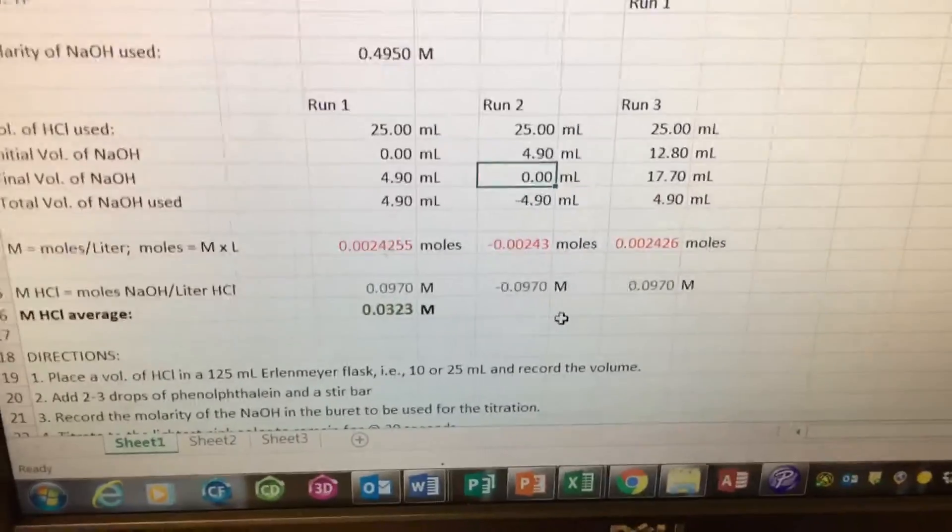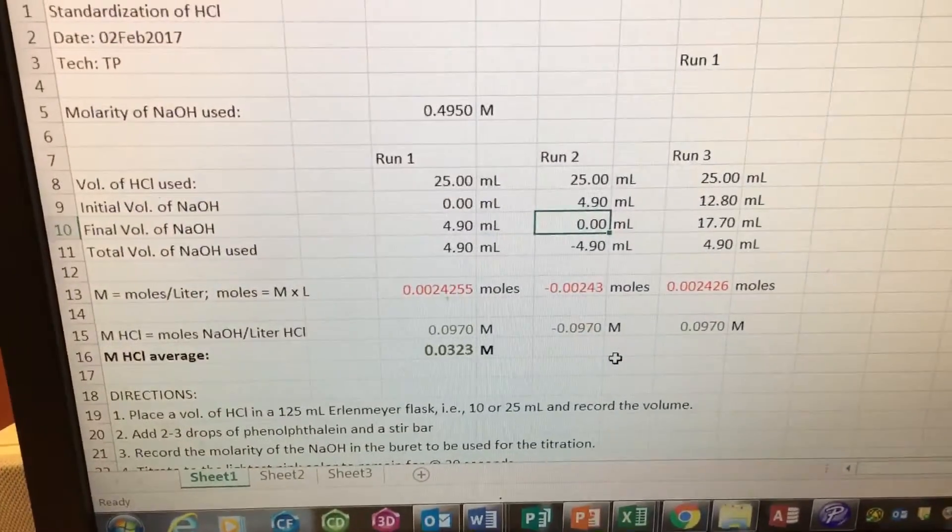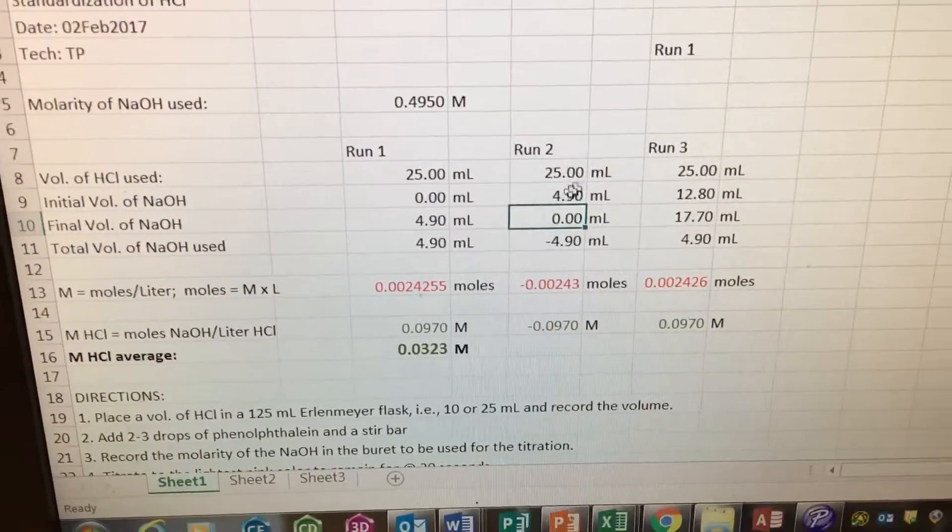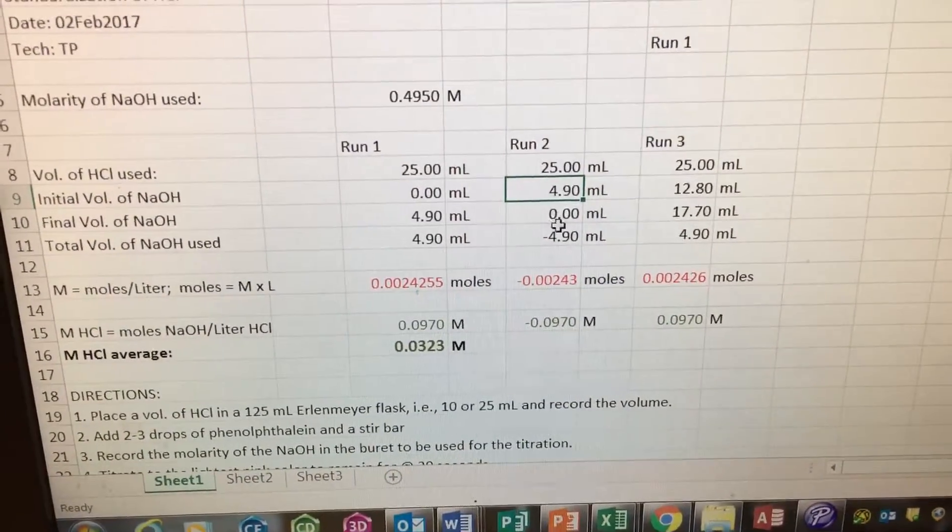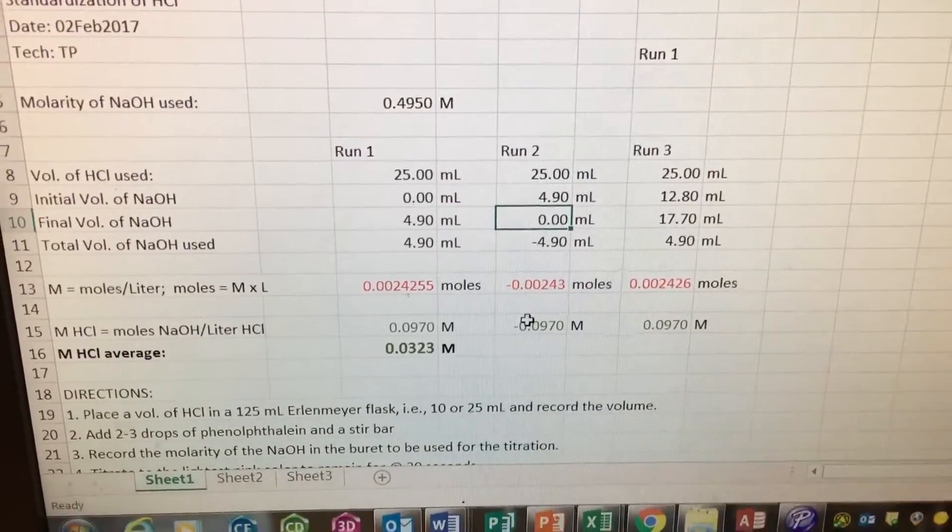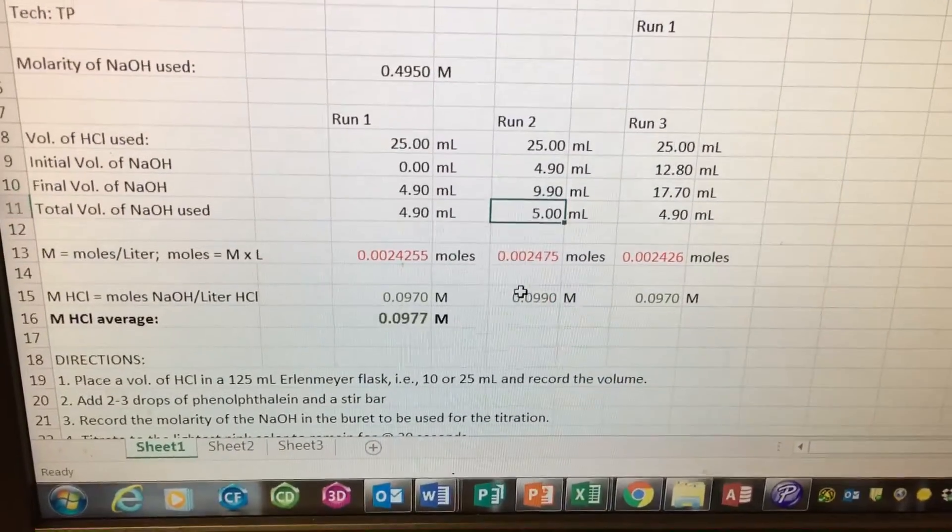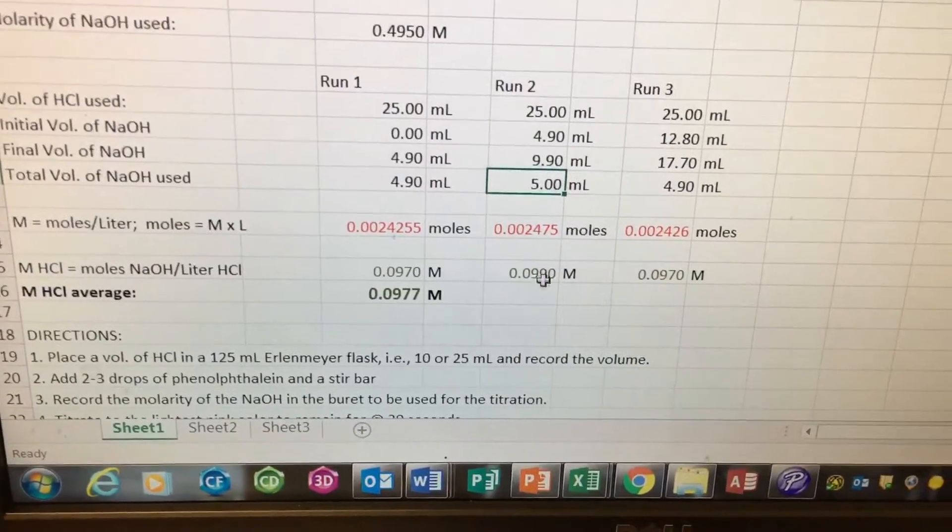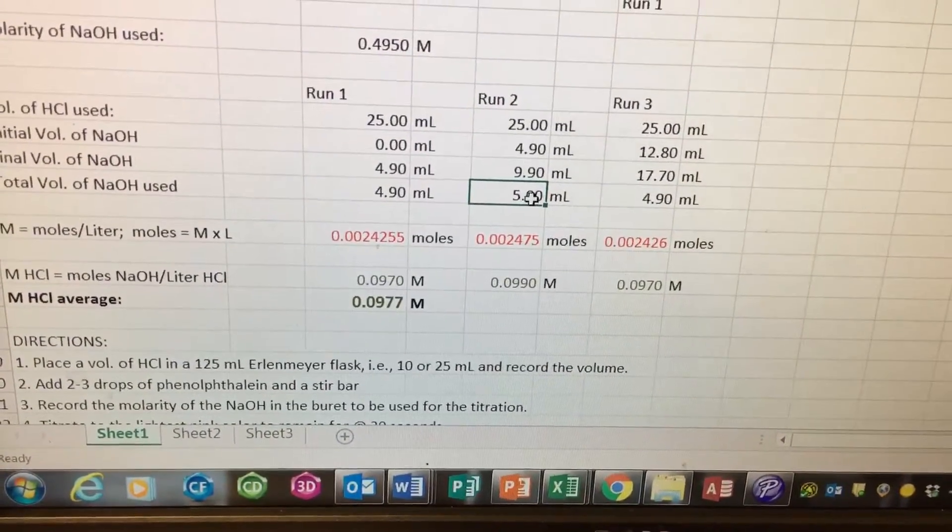Remember the first one restarted that much. So this is the second trial. All right, I'm gonna change to 9.9, see how it goes. Okay, so that's the second trial.